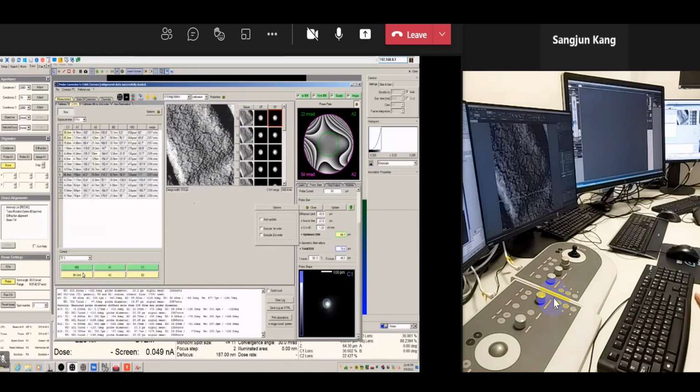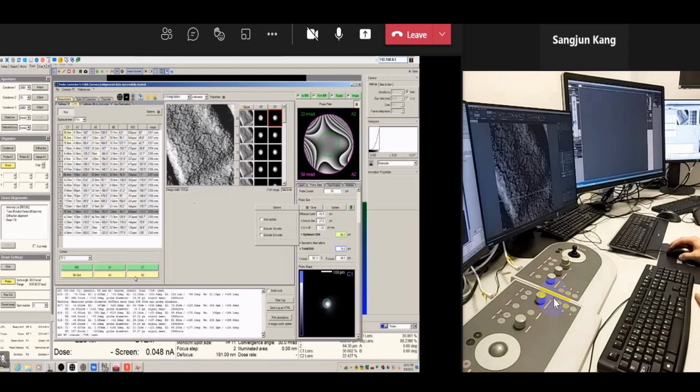That will really help you a lot, especially for measuring an unknown sample, because high order aberration will be stable after you change the sample, but the low order aberration can be a little bit affected by the sample changing. Also, if your sample is a magnetic sample, it will affect the objective lens. Then the low order aberration can be changed a little bit.